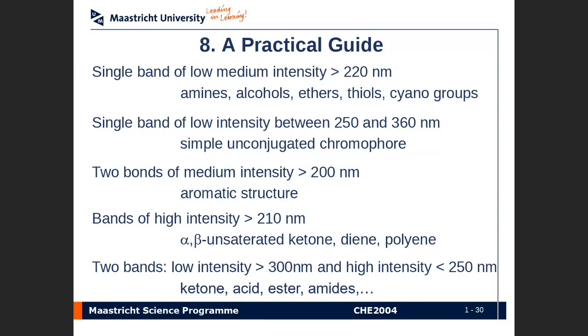From a personal point of view, as a researcher, I use UV-Vis spectroscopy at the end. If I know what the chemical structure is, I will then record a UV-Vis spectrum as a final characterization point, which will usually correspond to one or two or three values, and that will tell me something about the energy levels in the molecule, chromophores and so on. One of those will typically correspond to a color, let's say. Okay, so it's important to do this, but it's also important to realize that its utility can be quite limited.